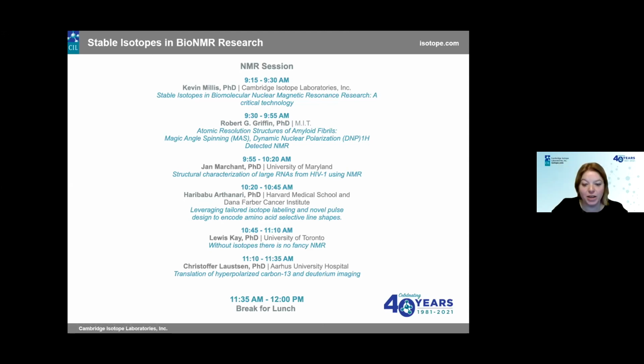Kevin, we did have one question that you partially addressed. Can you comment on F19 labeling of proteins? Well, using fluorine has been going on for years.